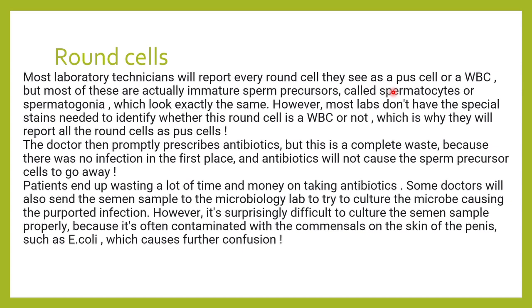They will directly report them as pus cells — perhaps 50 to 60 or 20 to 30 per field. The doctor will then promptly prescribe antibiotics, which is a waste of time and money for the patient, because there may be no infection at all. Sometimes they even end up doing a semen culture, and organisms like E. coli may grow because they are normal commensals too.